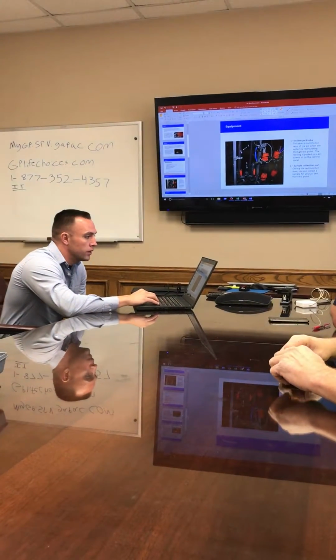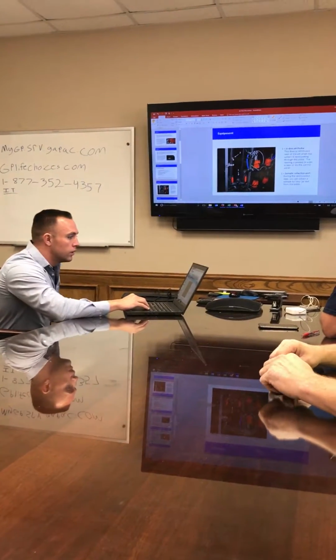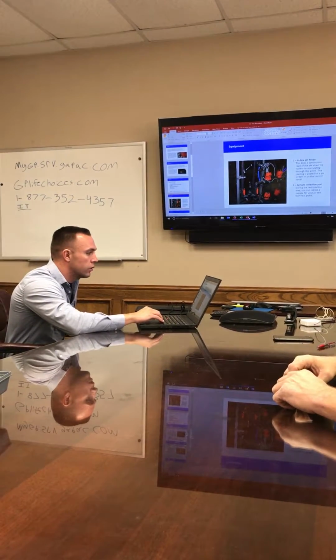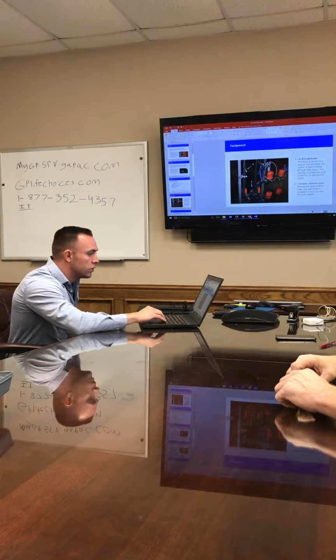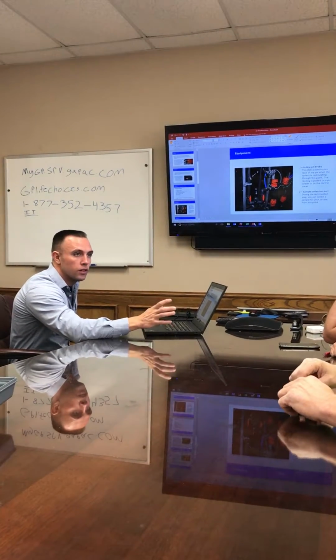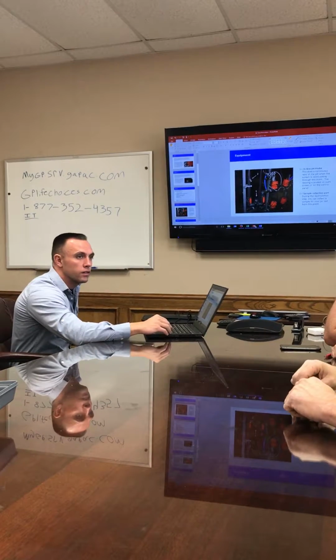Some equipment. Inline pH probe. This does a continuous read of the pH when the system is recirculating through this point. The reading is posted on a pH screen or on the control panel. Y'all are familiar with the pH meter? Yeah. Calibrate that every month.